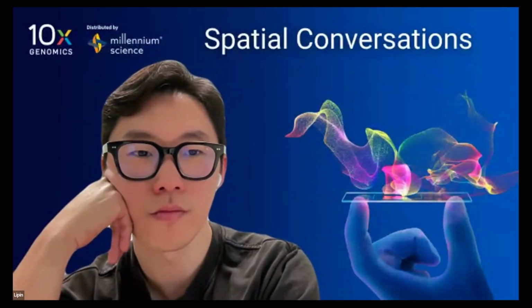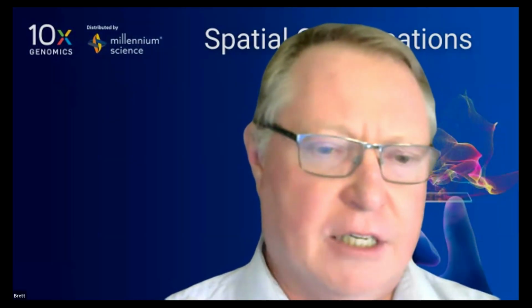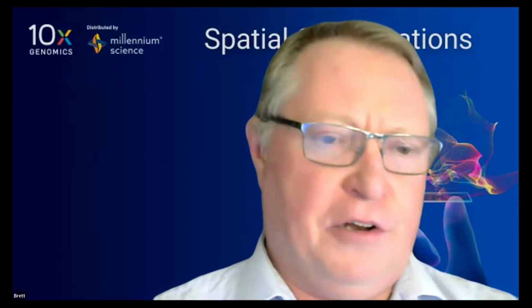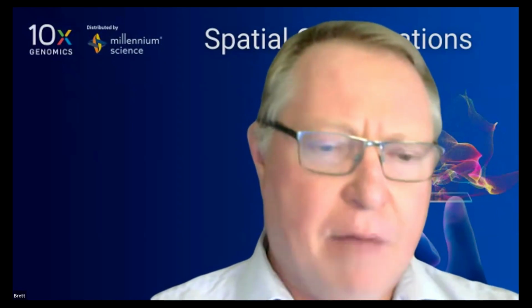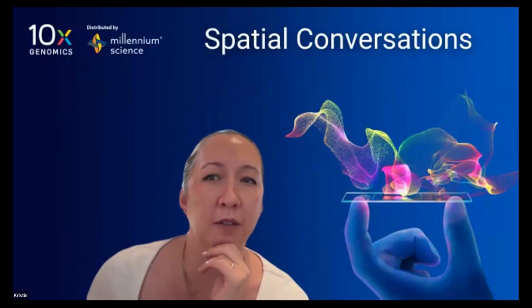And we find with Xenium, it's a little bit more sensitive than Visium HD. I think that's in line with what you saw in your own work, that with Xenium you were able to see things a little bit better. It's not a huge gap, but it is there.